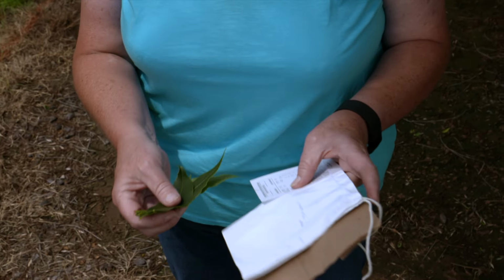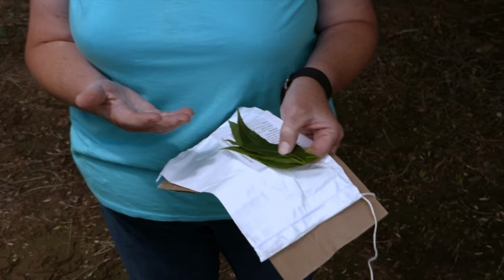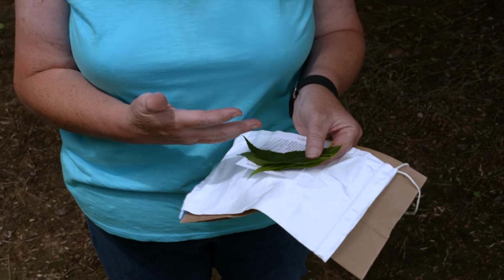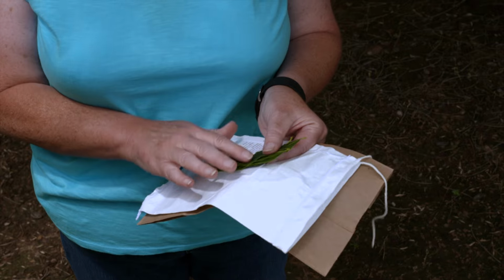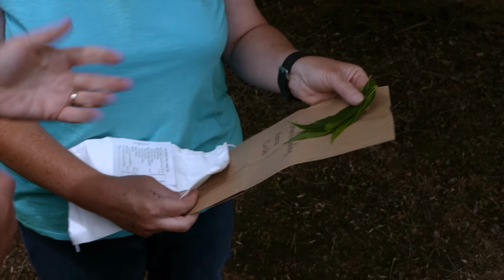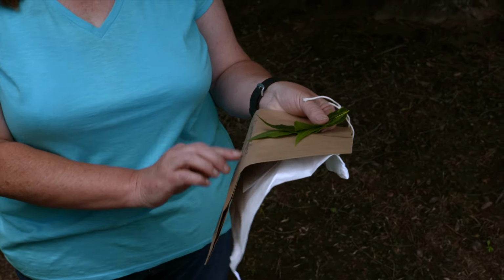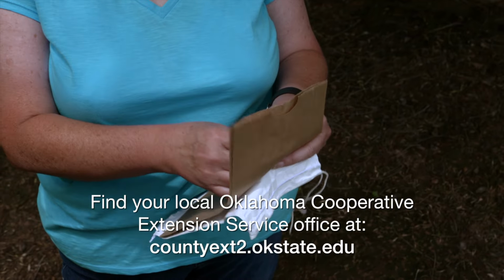Because these might have been sprayed with a fungicide or insecticide, or you may be next to a dirt road with a lot of debris in the air, we're going to take these leaflets back and rinse them off really quickly, not soak them in the water. Lay them out to air dry, and once they're dry, put them in a paper sack. Do we want them dried crispy? That would be good, if they're dried completely where they'll be crumbly. Then put them in a paper sack and label it with your name, what it is, and the location, so you'll know when you take it to the county office what it is, and you can get the right results for the right area.